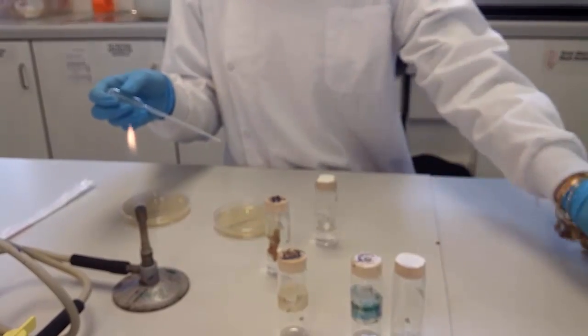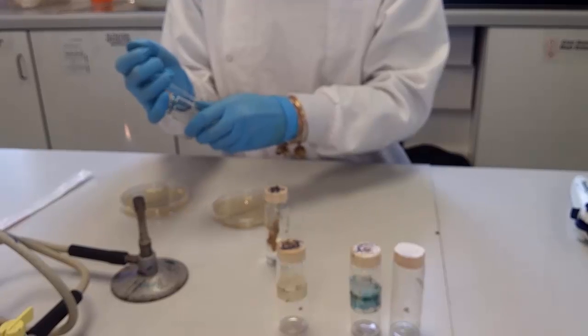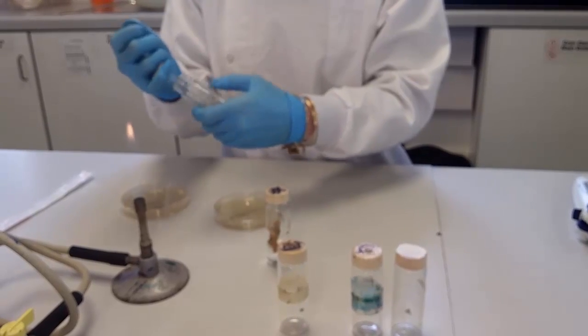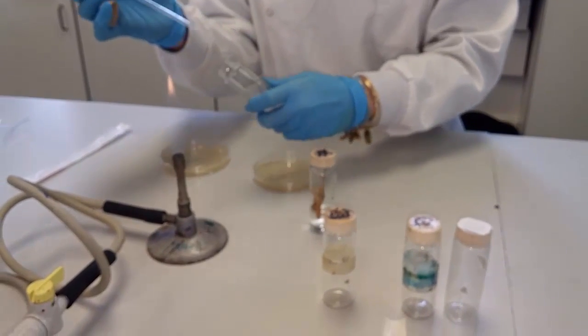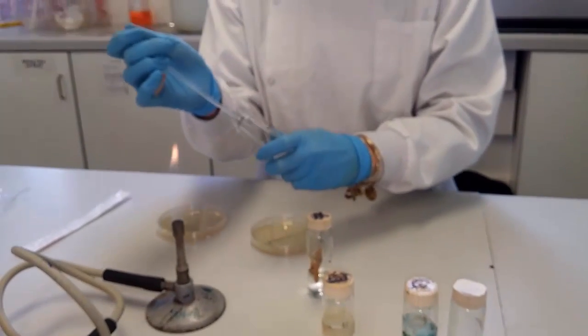Next, we will perform the spread plate technique. 5 plates will be spread, one for each dilution, 10 to the minus 1 to 10 to the minus 5. For this, aseptic technique and the little finger technique will be used.